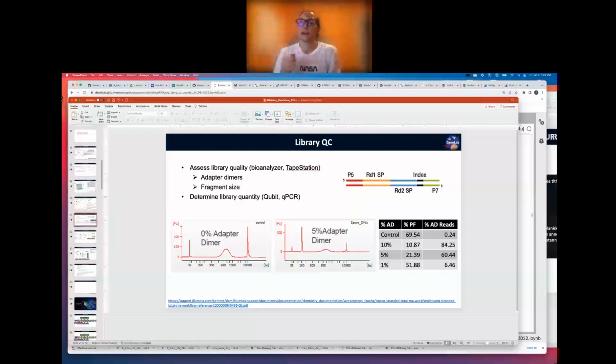So then we take our pool and we spike it. When we do our iSeq run, if we see that these 3 ground control samples have like half the reads of all the other samples, then before we run it on the NovaSeq, we do a calculation to see how much more of those samples we would have to add to our pool so that we get roughly the same number of reads per sample.